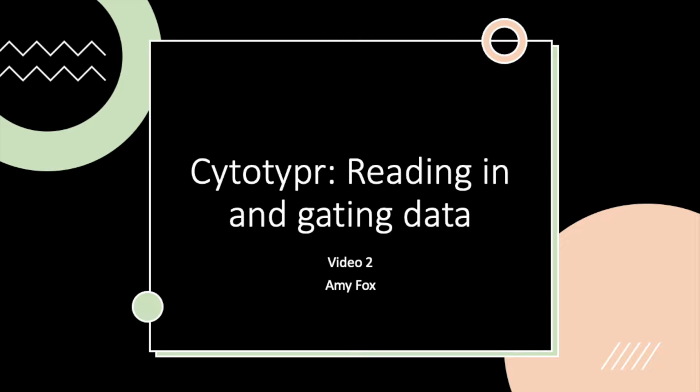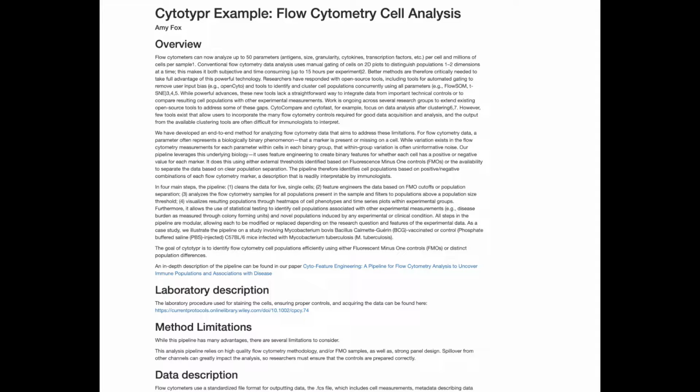Okay, and so now I'm going to be talking about cytotypr and how to read in the data and do some initial gating. I have a lot of stuff written here that you can go through in a little bit more detail as you're trying to gate and analyze your first flow cytometry data.